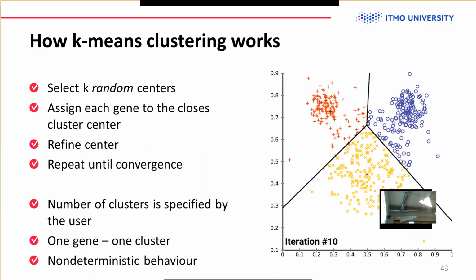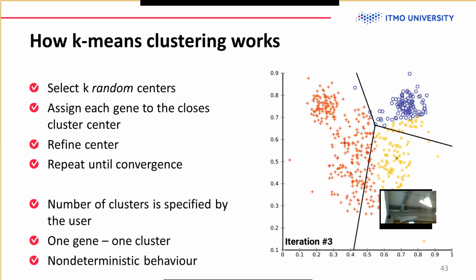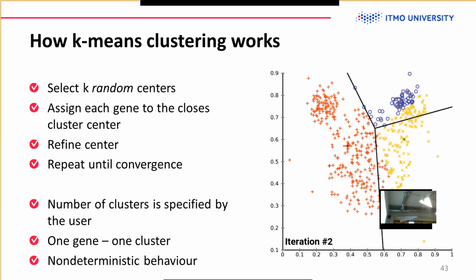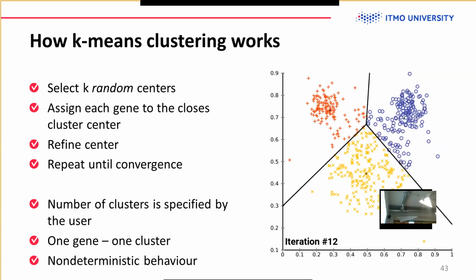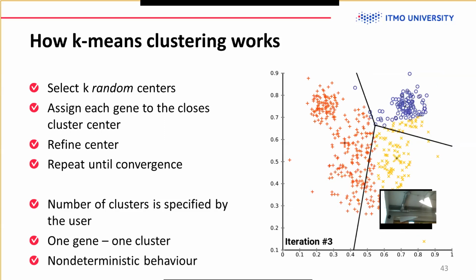It's actually called clustering because each gene is clustered in one of these K clusters. You should see this on the GIF on the right. This is a GIF from Wikipedia about how k-means clustering works. For some genes, probably they shouldn't be in any clusters. They are like outliers, noise, or whatever. Some genes you can't really tell. Formally they are in the red cluster, but actually probably biologically they should be in this bottom cluster.